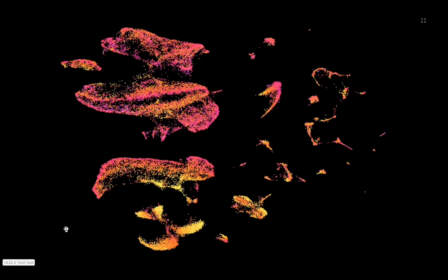Hi. I wanted to start with this beautiful image and just ask the question: how do we go from our research idea, a sample, to sequencing reads, from the reads to gene counts, and from gene counts to an image like this, where every dot is a single cell that we sequenced? And how does an image like this help us to understand the sample, the question, and the heterogeneity of the cells in our sample? This is the topic of my lecture today.